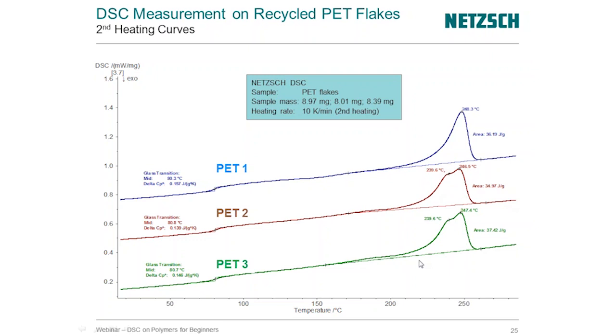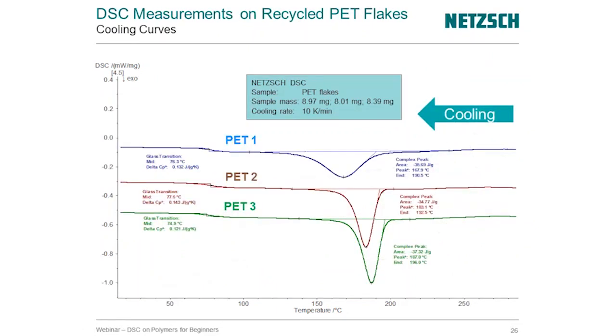Now, that maybe gives us an idea that if we know this is the closer to the good material, we've got an issue with contamination in this material. So it's also really neat to look at this material on cooling and see how it behaves as well.